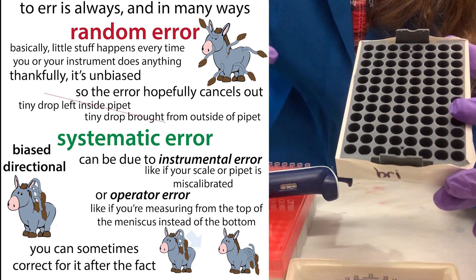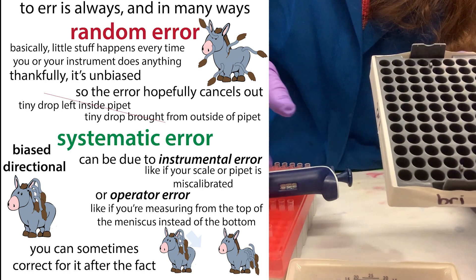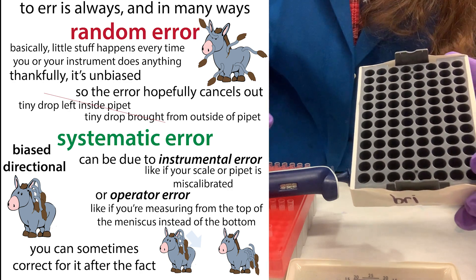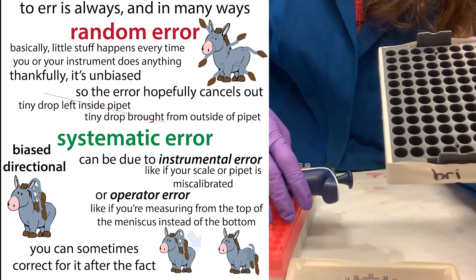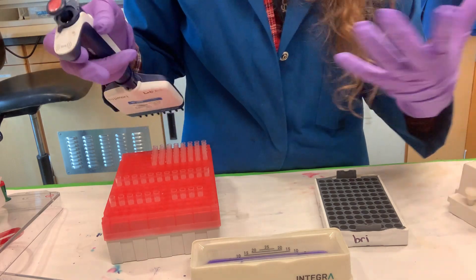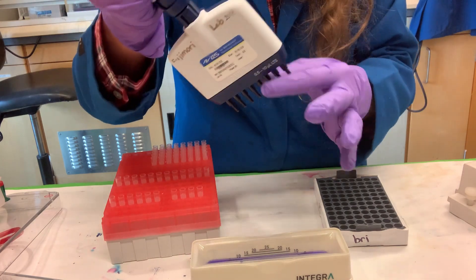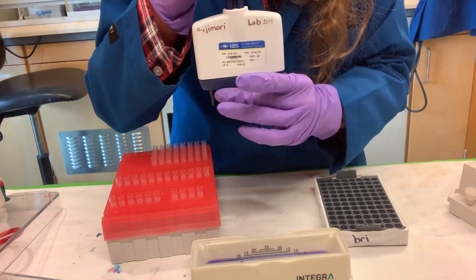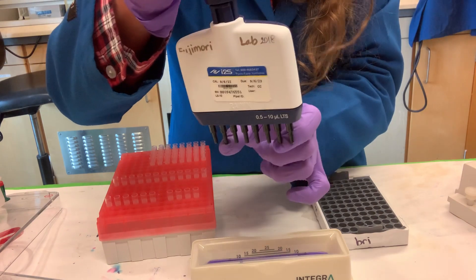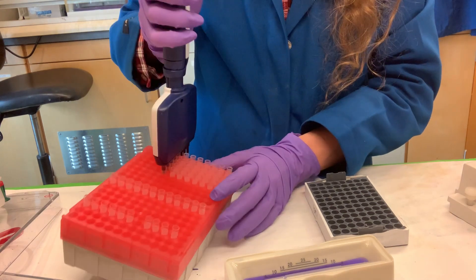Rotating sample positions throughout the plate accounts for pipetting differences and helps even out those systematic errors. You also have random errors — like a bubble getting caught somewhere in the plate — and to avoid those you want to keep a close eye on the liquid levels as it goes in and as it goes out. Sometimes you might not have a full 8 or full 12 samples when using a multi-channel. In that case, you want the tips you're using to be in the center, because that's where pipetting is most even — the edges are where you tend to have the most problems.